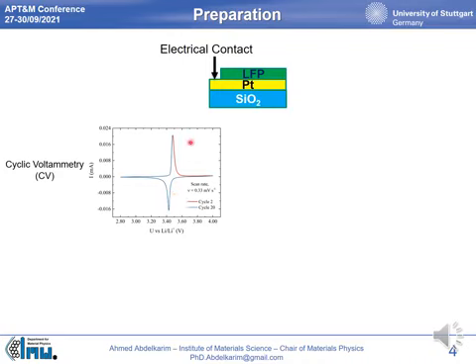At a specific voltage, the process is stopped. In this example, we stopped at 3.48 volt. The terminated voltage values depend on which phase I need to study. For example, 2.8 volt is the fully lithiated LFP, 4 volt is the fully delithiated phase FP, and in between are the two phases LFP and FP.